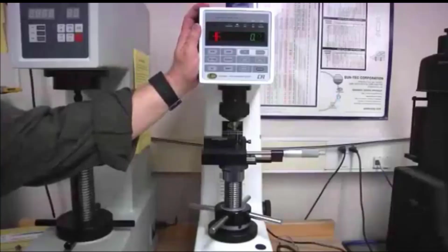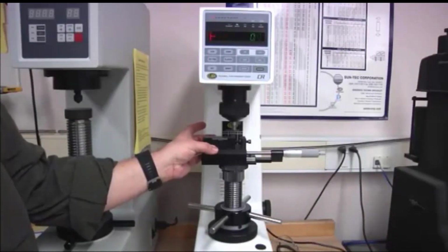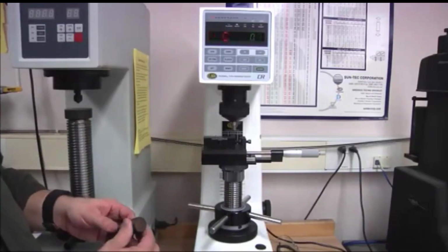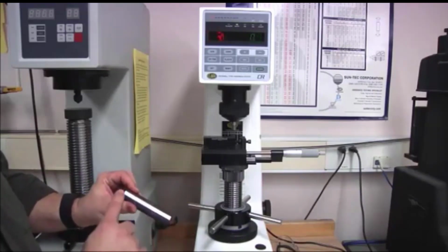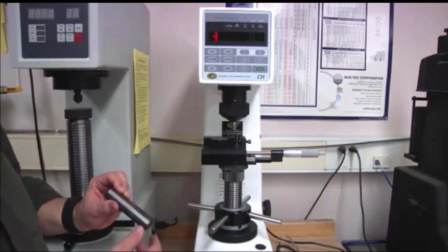So we're back to using our Rockwell hardness tester. We have a special stage installed for doing the hardness tests on our bar that's been quenched on one end. All right, we can see the threaded hole on the other. We've machined a flat. This is a very slight deviation from the ASTM standard.